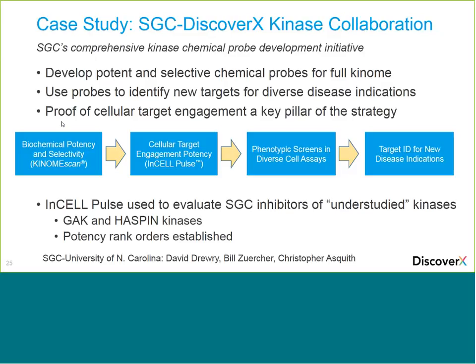And so what they ultimately want to do is identify and improve these molecules so that they can test them in phenotypic screens to figure out what kinase targets are good for different diverse disease indications. This is a phenotypic screening approach.